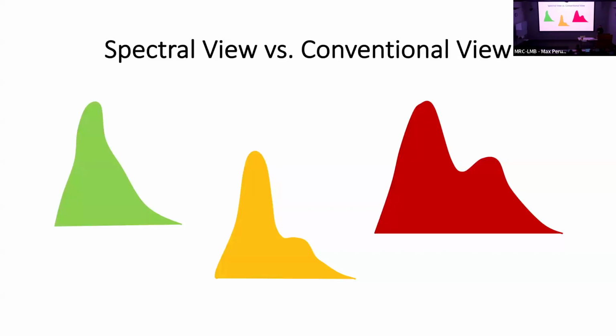A second really big advantage is the readout of base autofluorescence. If you're looking at a mixed cell population, for example peripheral blood mononuclear cells, where you have lymphocytes, monocytes, maybe granulocytes, they're all going to have varying levels of base autofluorescence or background, based on their inherent cellular properties. Granulocytes, for example neutrophils, can have a very lobular nucleus. Lymphocytes are basically all solid nucleus. So they look very different on their scatter profiles, and that also translates into very different levels of autofluorescence.